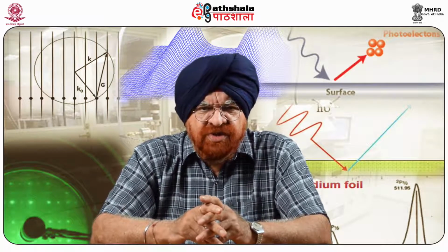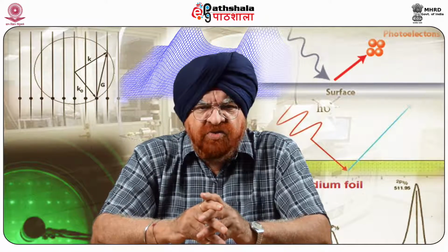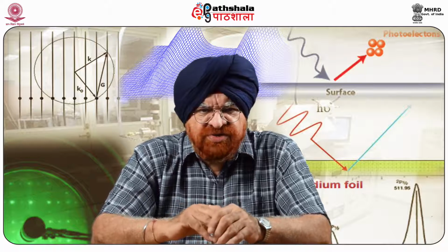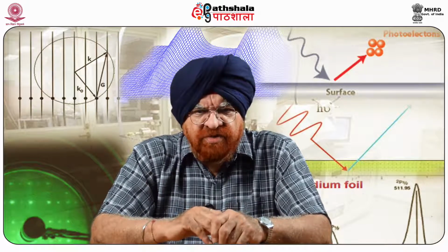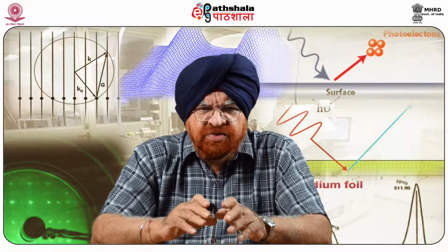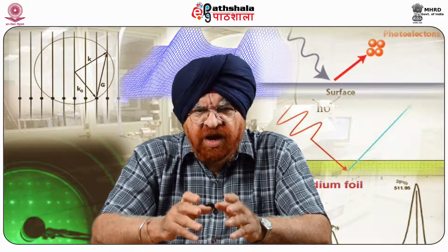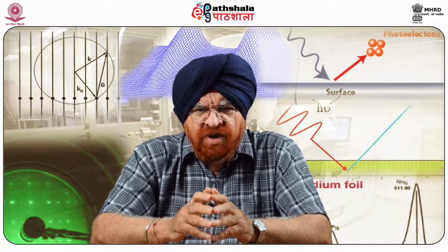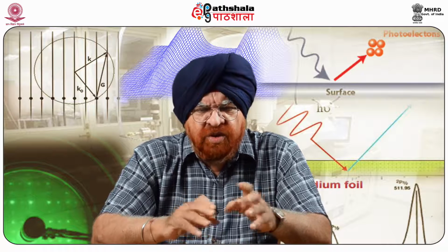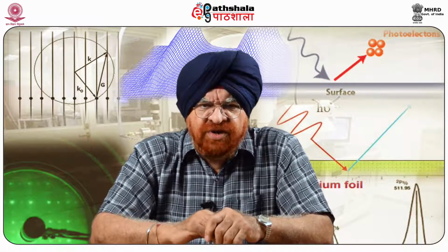Atomically sharp tips are typically prepared by electrochemical etching of thin wires such as tungsten, platinum iridium, or gold. The choice of the RE depends on the electrolyte and the electrochemical problems under study.